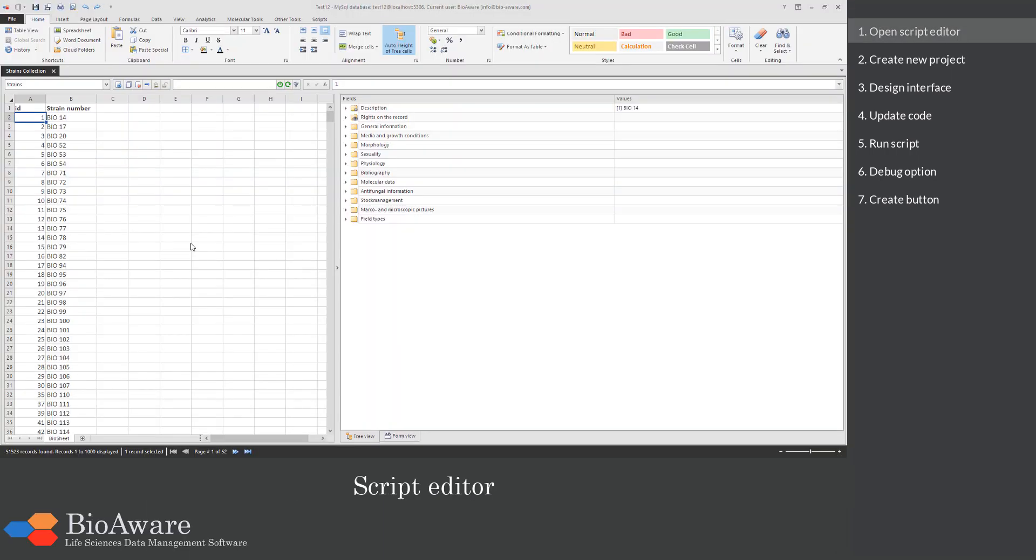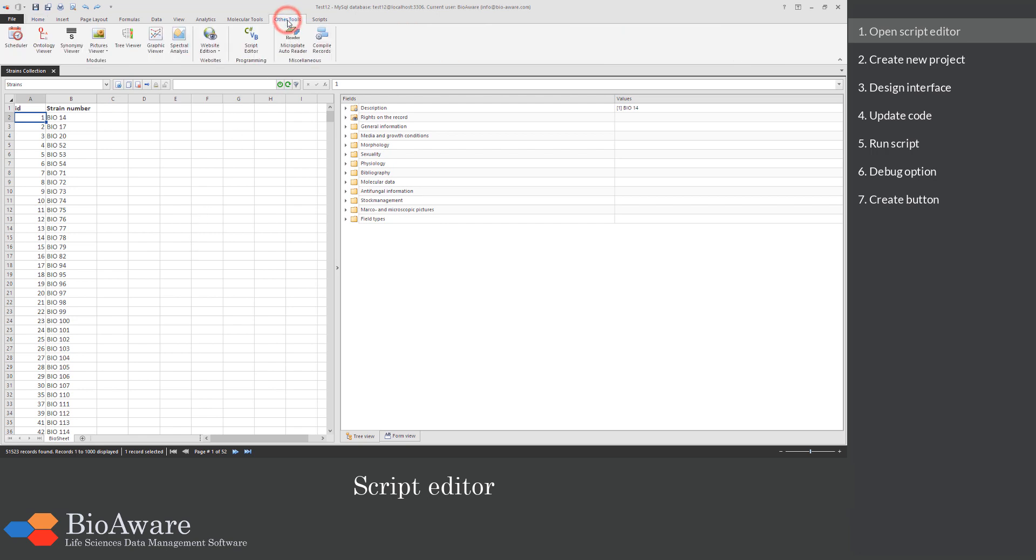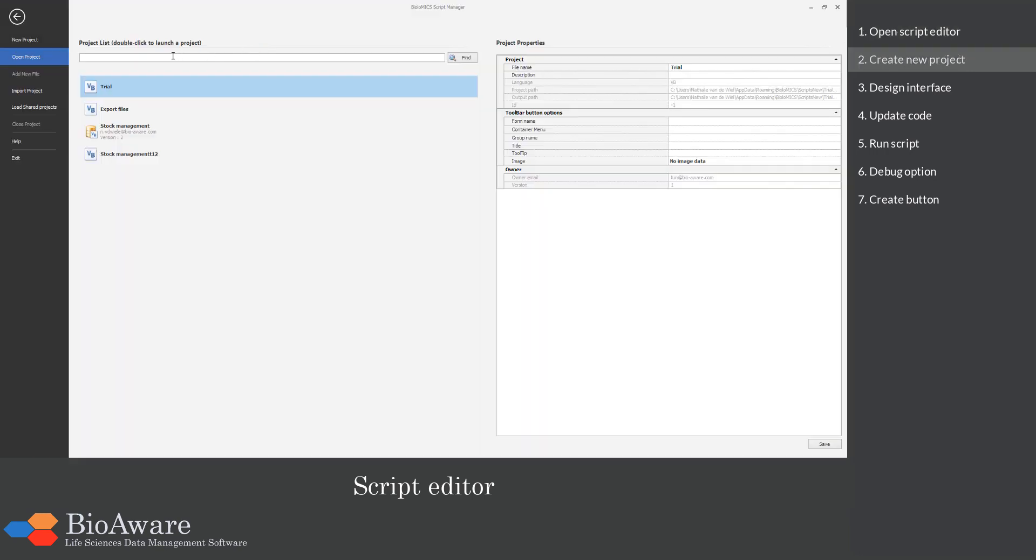It is possible to add new functionalities to Biolomics. To do so, go to the Other Tools tab and click on the button Script Editor.